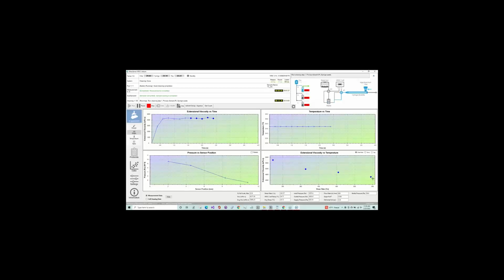So although it says shear rate on the plot here, because this software is meant to handle extensional and shear rate, this is kind of a tricky thing for the software to change. But what we're looking at is extensional viscosity versus extensional rate. And as I said, this thins just as it would under uniform shear.